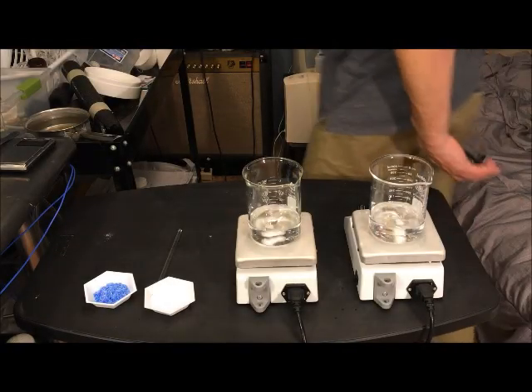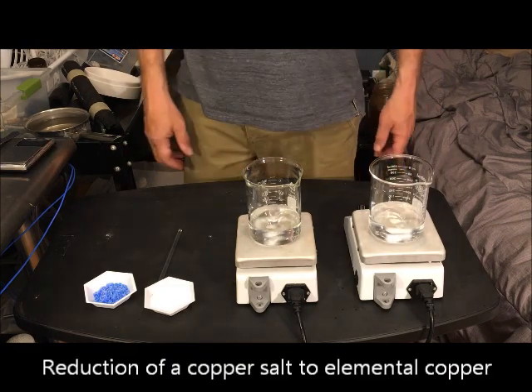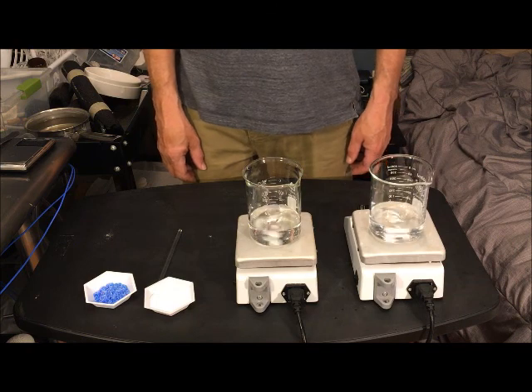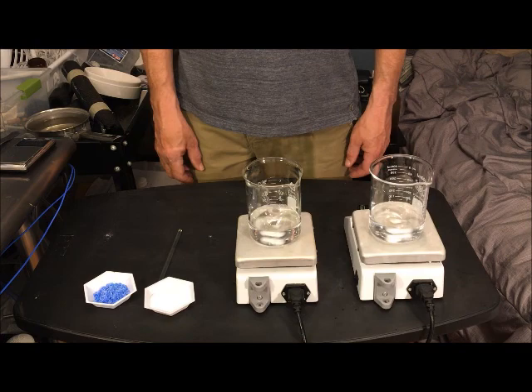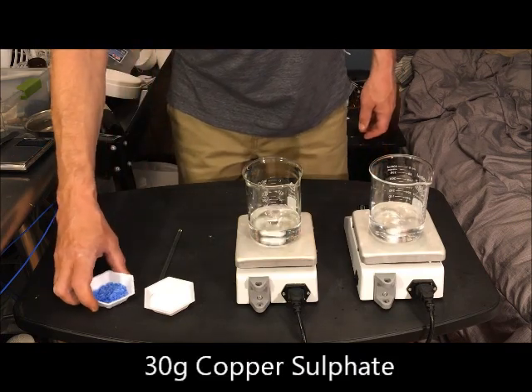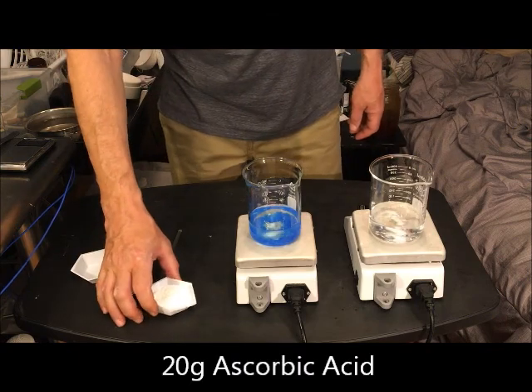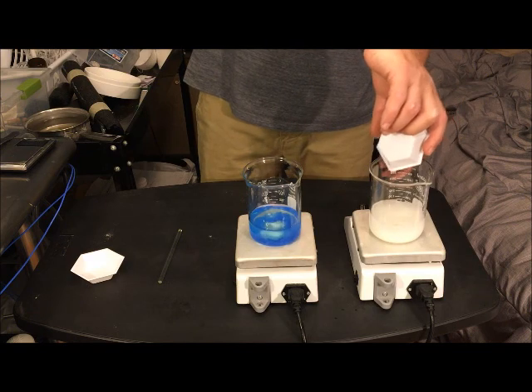To make our copper nanoparticles we're going to be chemically reducing a copper salt using a reducing agent. Any copper salt should do. I'm using copper sulfate, which is commonly sold as a pottery glazing agent, and ascorbic acid, also known as vitamin C. Dissolve 30 grams of copper sulfate into 100 milliliters of hot water, and 20 grams of the vitamin C also into 100 milliliters of hot water, and continue stirring thoroughly.